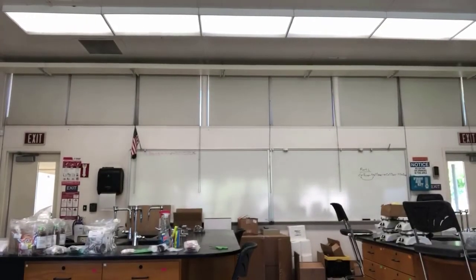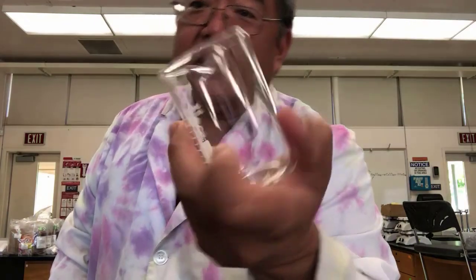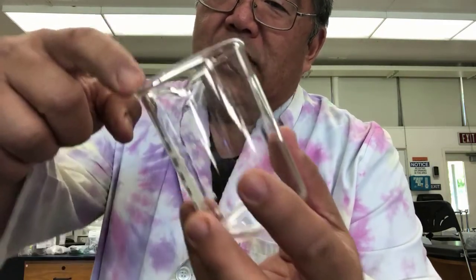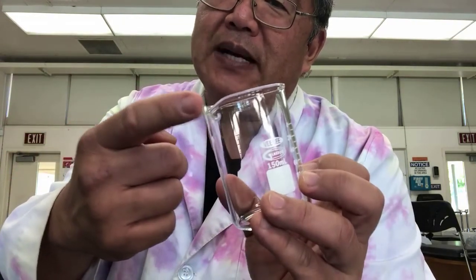The other one is, if the glassware that you have has cracks in it. See, now I know which one's hot because I did it, right? Now this doesn't have any cracks, but what you should do is inspect along the bottom and the edges. This is where people most often ding things, and look for little cracks. There's also along the edges at the top, you'll see cracks. Now a chip here is sometimes okay.